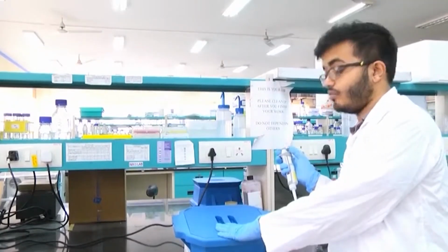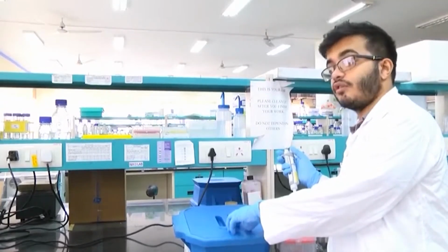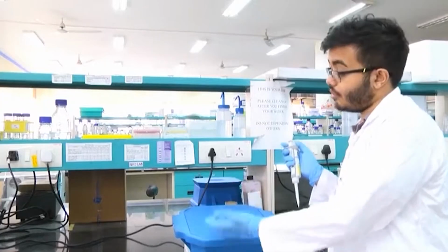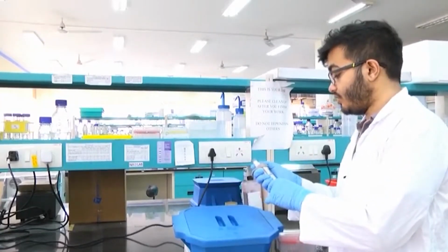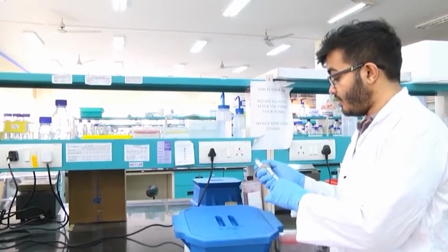Do not reduce the incubation time below that, because that will reduce the efficiency of your transformation, and ultimately you will get lesser number of colonies or maybe no colonies at all the next day. So, what we are going to do is, since we have time today, we will leave it in ice for 1 hour.